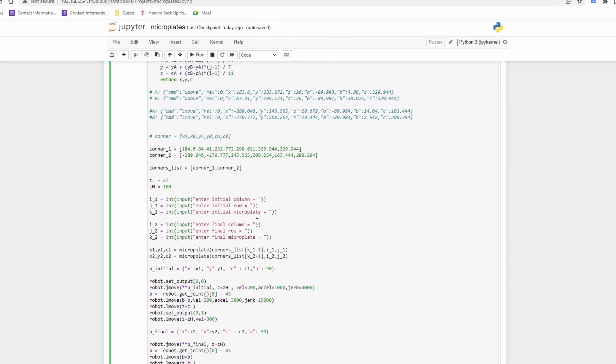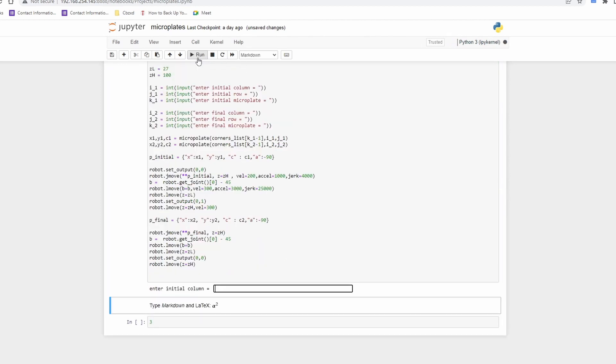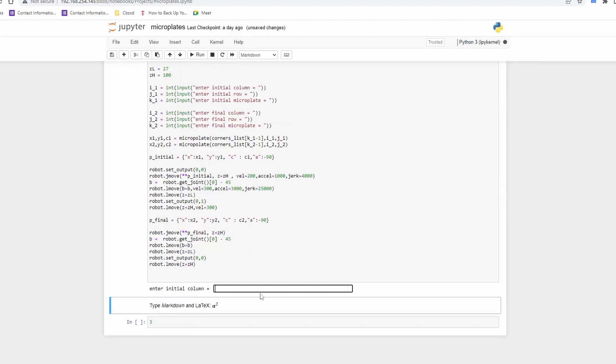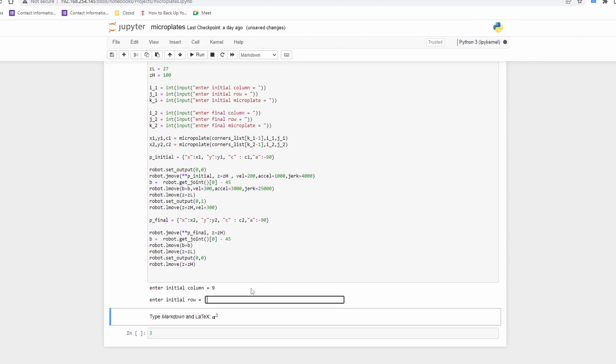Here we ask the program to pick from the column 9 and row 3 of the first microplate and place it on row 4 and column 4 of the second microplate. Here is the result.